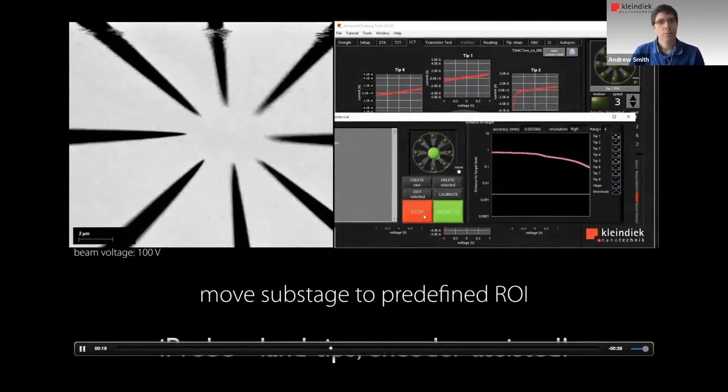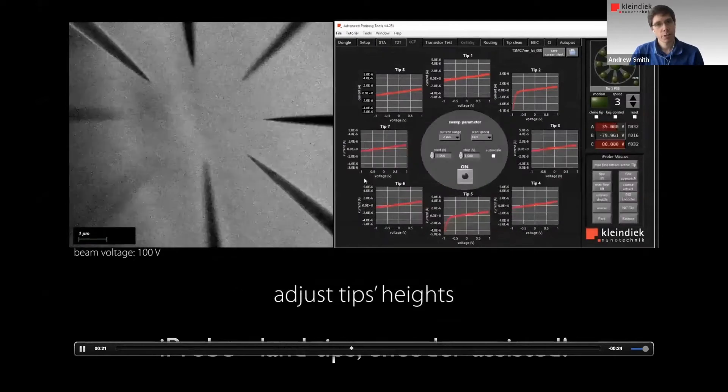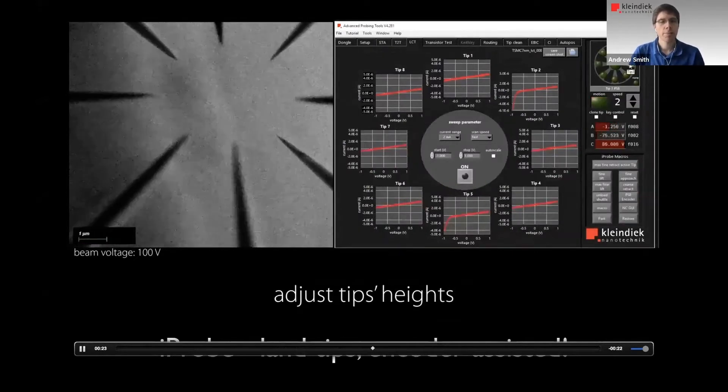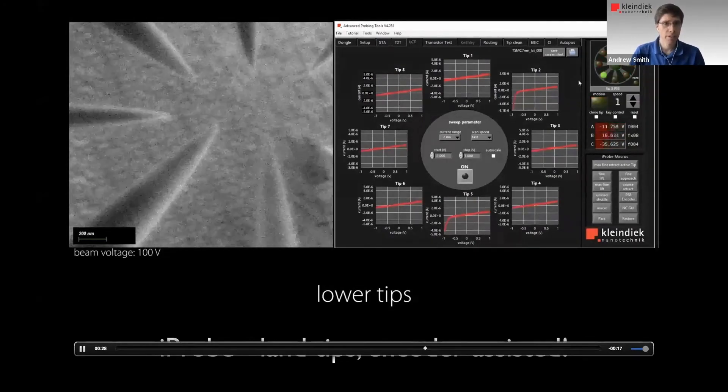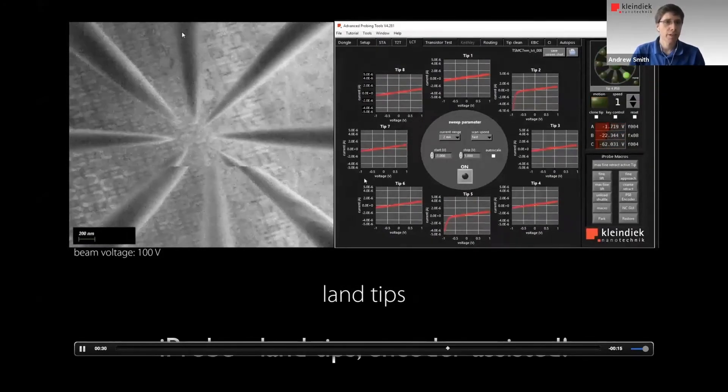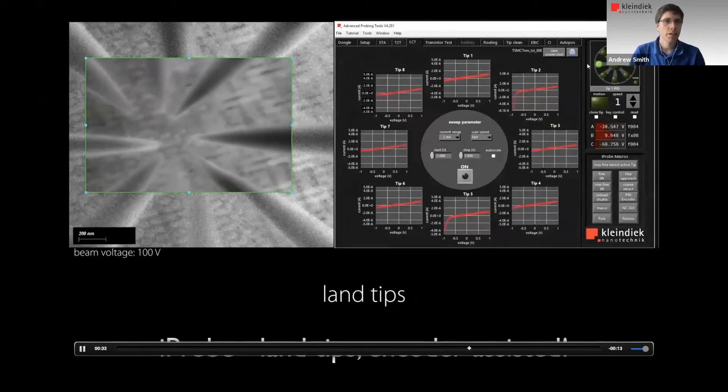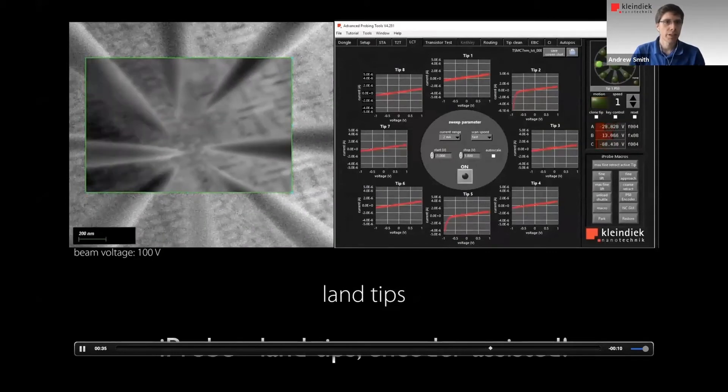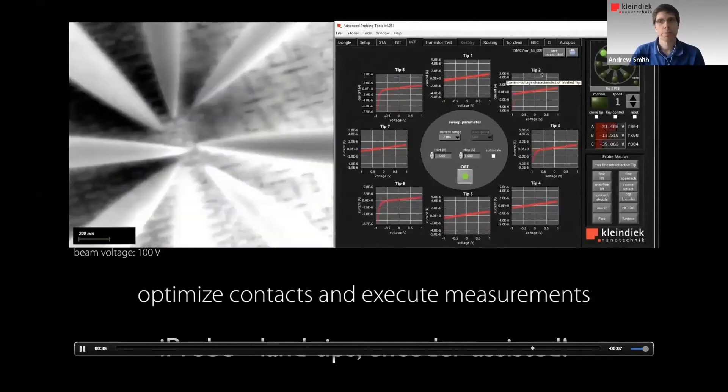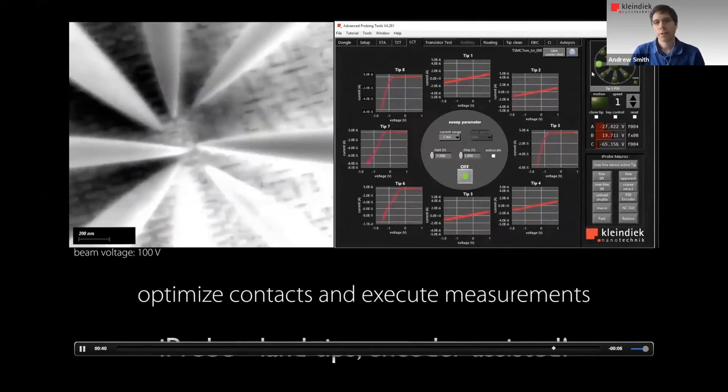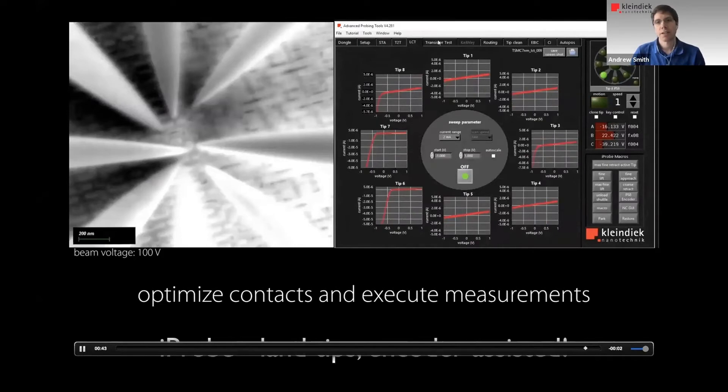This is followed by a manual step where we pre-align the probes at a radius of one micron and center them in the frame. Then comes now the automated step where we move the sample stage to within the probes vicinity. And then, as we saw previously, the tips are landed on the substrate. In this case, we're looking at a seven nanometer device. And you can see now the probes are being landed using drag and drop inputs with the mouse.